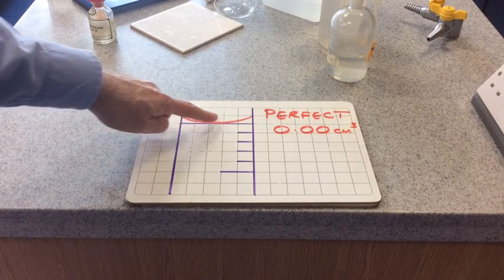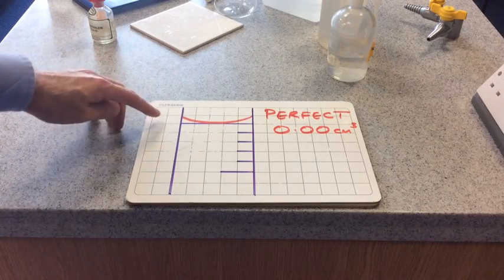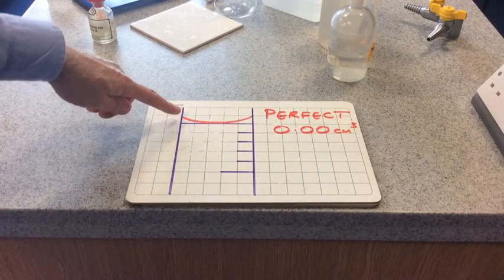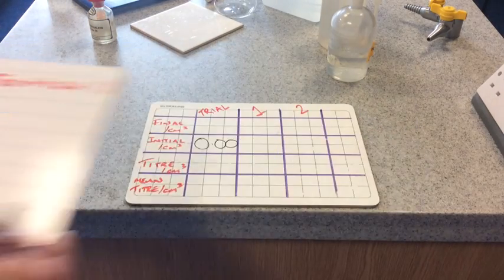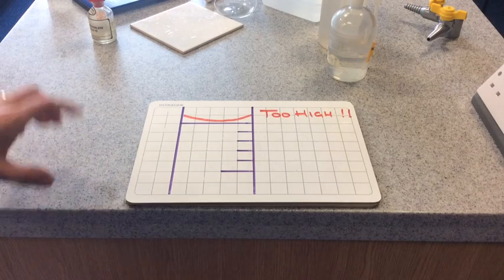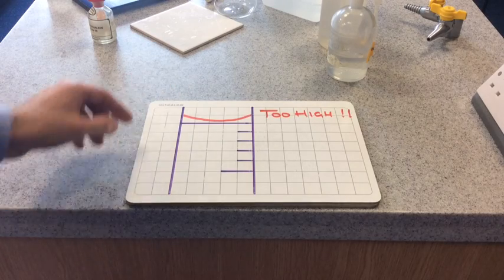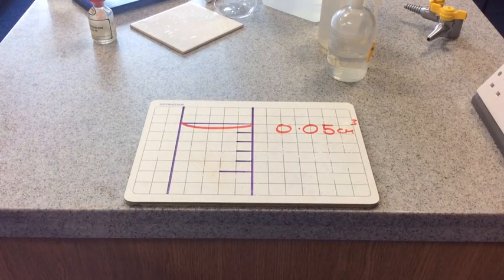Here you can see the meniscus — this red line is the liquid level. Surface tension causes the liquid to grip the glass and creates this curved meniscus. The base of the meniscus sits on the zero line, and we write that as 0.00 cubic centimetres. I've deliberately drawn the meniscus slightly too high here — you would run the acid down until the base of the meniscus sits on the line. If you slightly overrun, don't panic; as long as you know where the burette starts, that's fine.